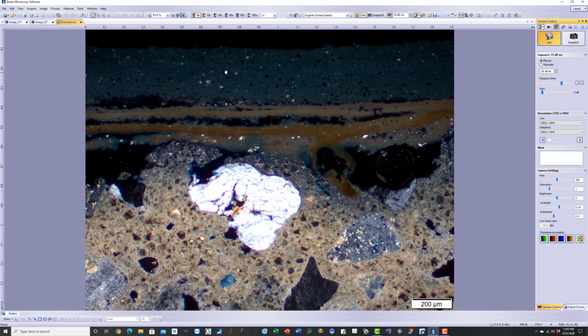And this paint layer, they're all acrylic binder, they're all acrylic medium, but this top layer, about 0.2 to 0.3 millimeter in thickness, has some fine silt-size quartz and some talc as mineral filler, and there are also some dark color opaque fillers present.